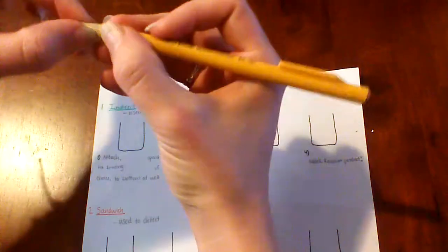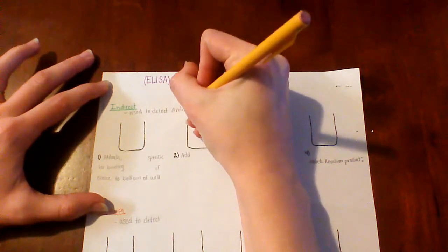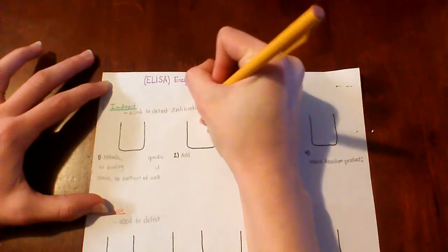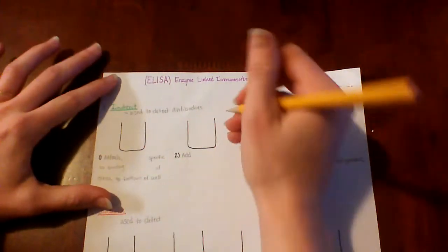So for the first method, the indirect method, this is used to detect antibodies, or a specific concentration of antibodies.